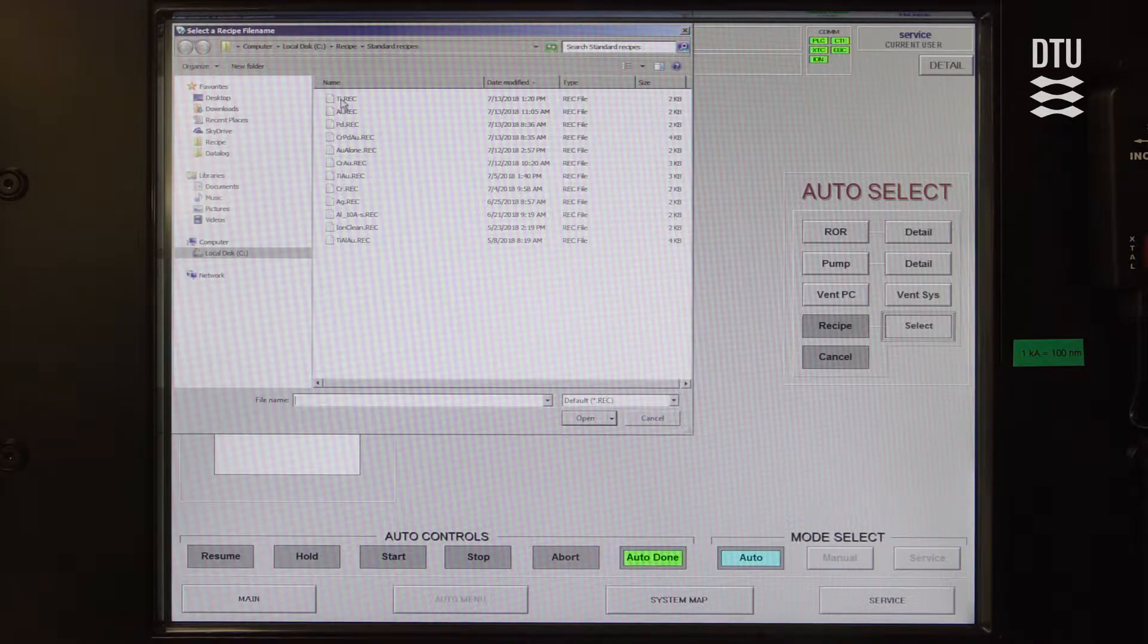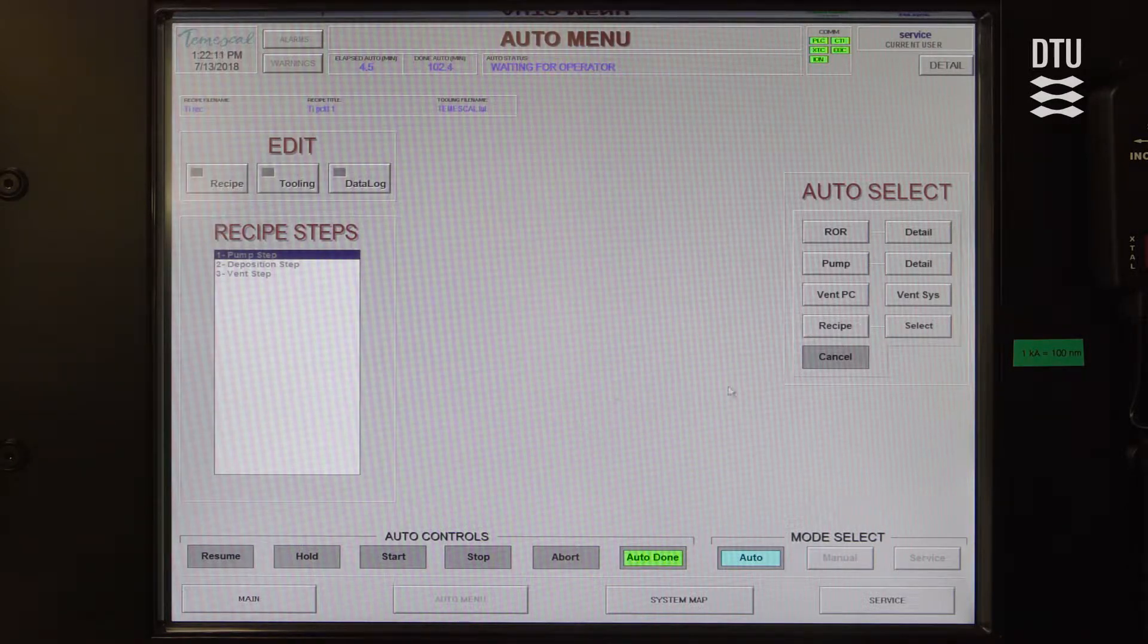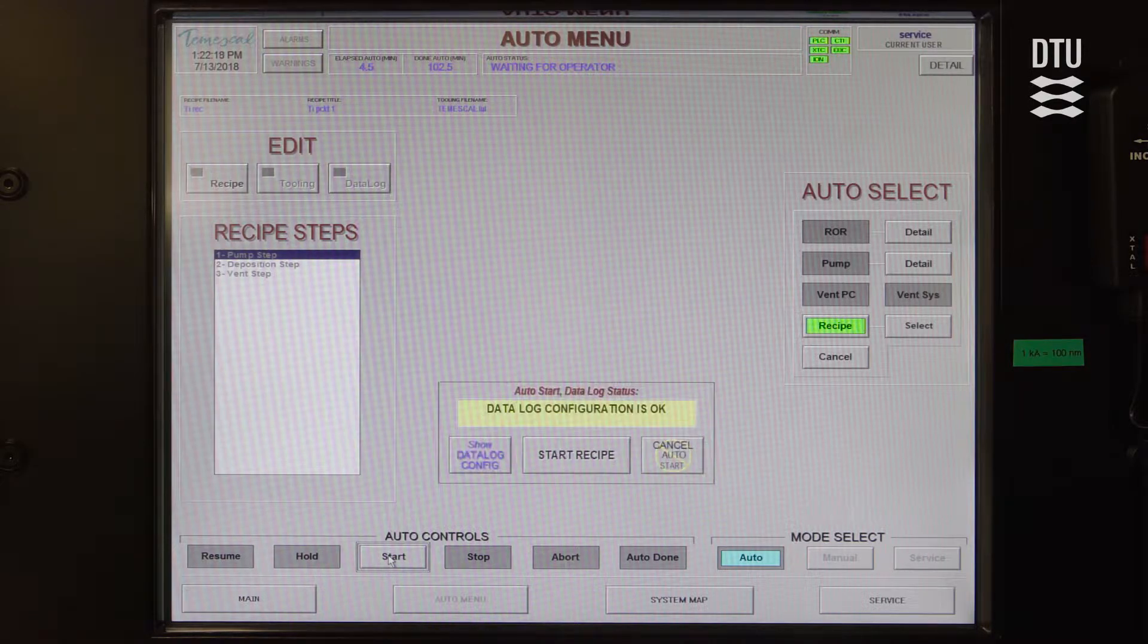We are going to run Titanium, so we open that and now we are able to activate the recipe by pressing the recipe button and then we press start. And because we have already saved the data log configuration, we can start the recipe immediately.